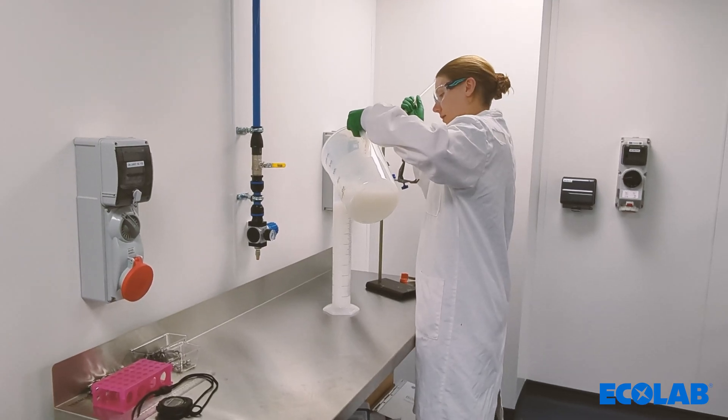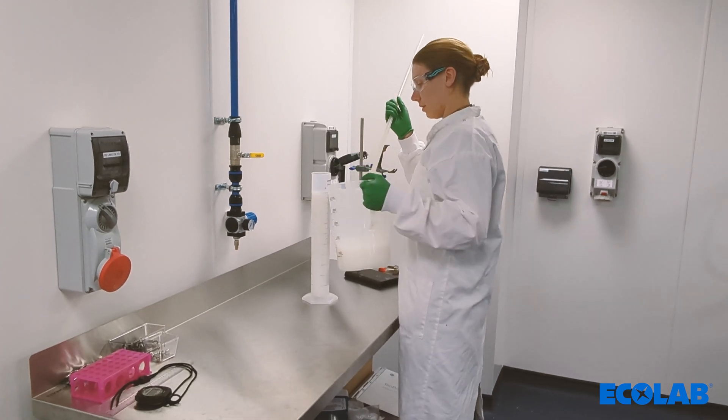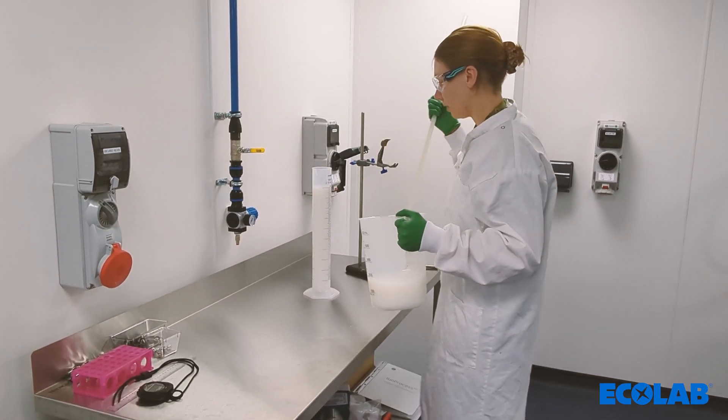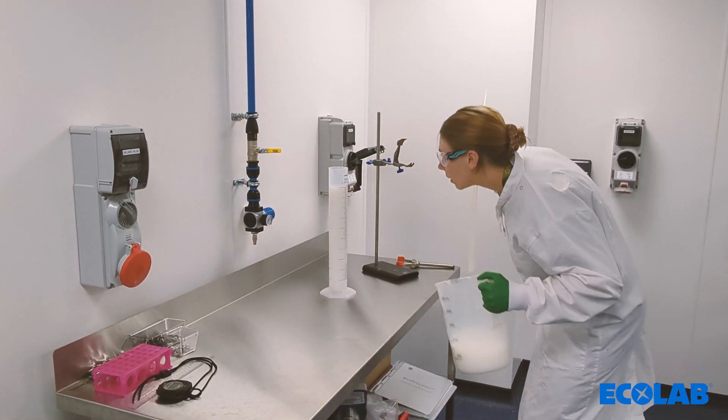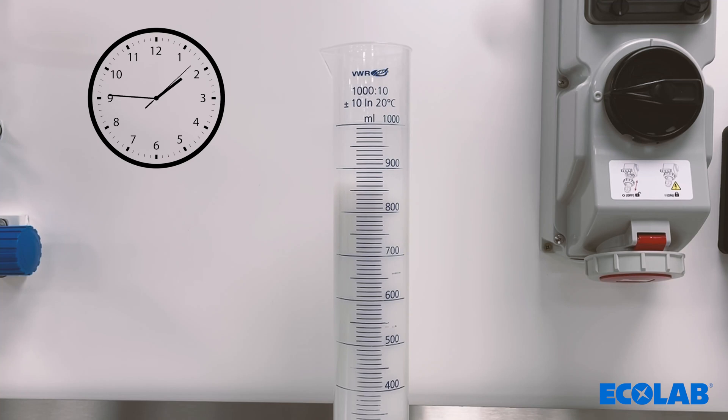Calculating the correct slurry concentration prior to column packing is a crucial step to allow for correct and easy column packing. There are several ways that this can be done, one of which is gravity settling. This is performed by allowing one litre of resin to settle in a measuring cylinder for 24 to 48 hours. A slurry concentration of 50 to 70% is recommended.